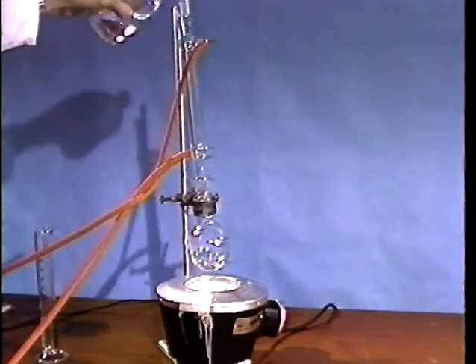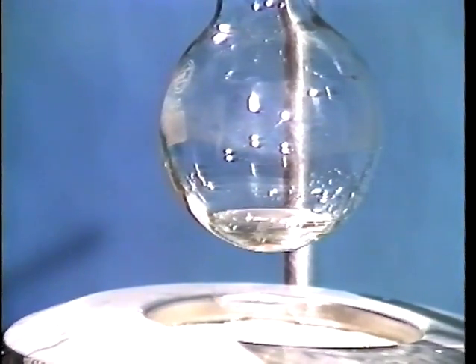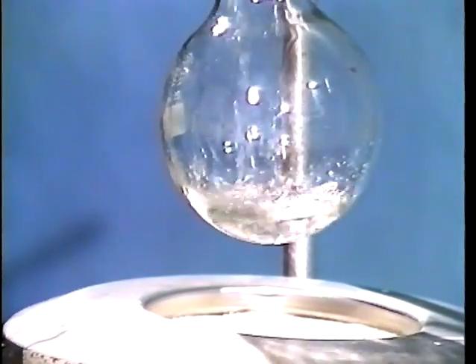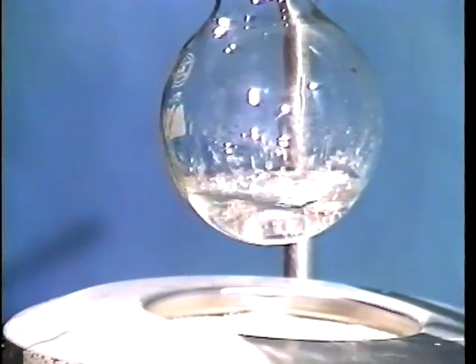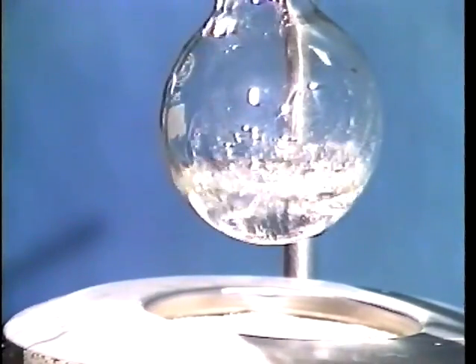Add the solvent in which you have previously found the solid to be completely insoluble. This may take considerable solvent. It depends on how much of the original solvent in which the solid was soluble you used.